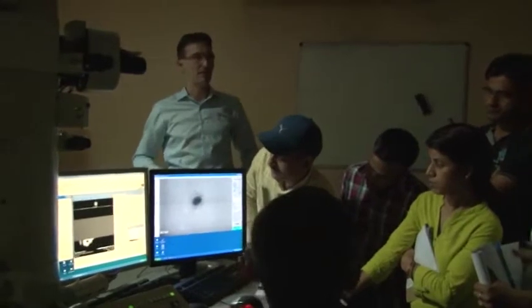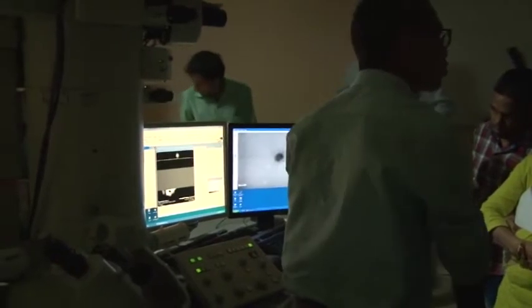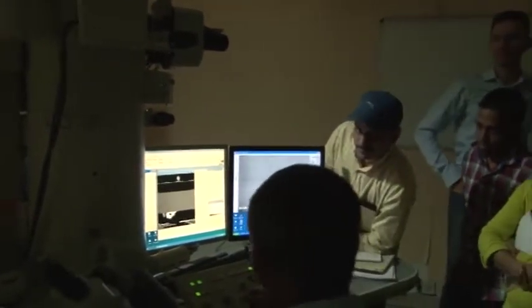Okay, so let's say that we have corrected the Z height. Okay, and then I stop it. So we have understood how to do it, and then you realize that that fringe, which was earlier so strong, has also reduced significantly. So we have seen that, and we have done it even at higher magnification.